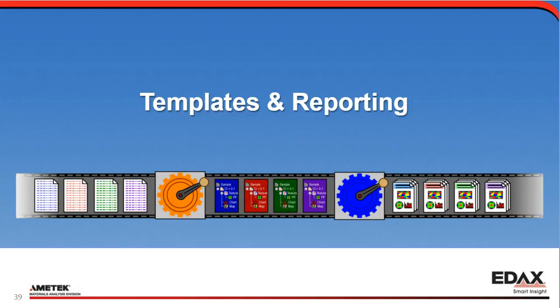So switching gears, I want to talk now about templates and reporting. And this is a really big change from what we had before. I know there were a few people who used some of the features we had before for building reports, but we've improved that a lot, and I hope this makes it much easier to use and more universal in a sense.